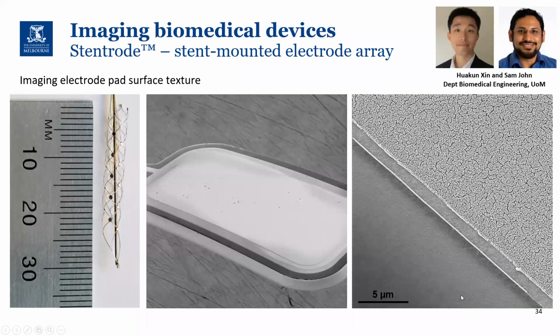We do a lot of work with biomedical devices. This instrument is in the Department of Biomedical Engineering, after all. So these are electrode pad surfaces from the stentrode. This is a stent-shaped multi-array electrode that can go up into the vascular system in the brain to stimulate and to read electrical signals within the brain.